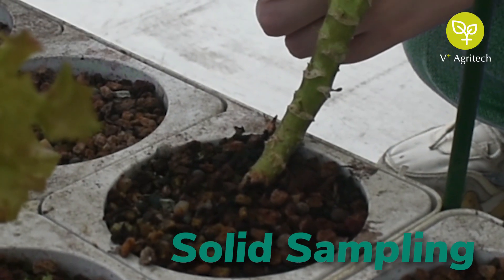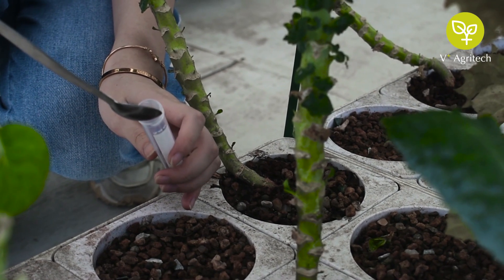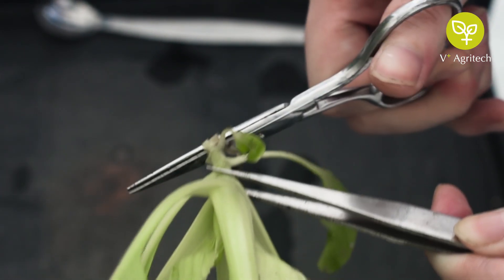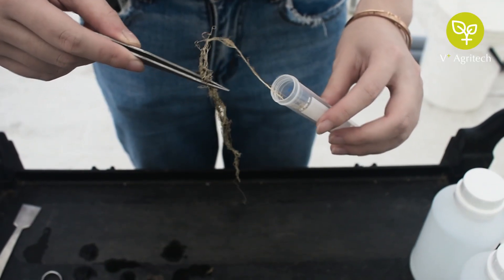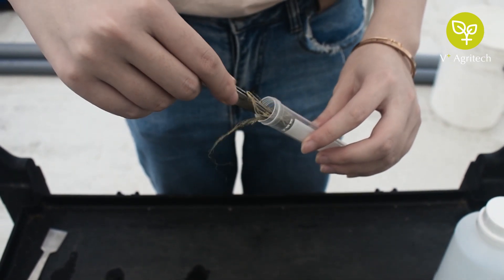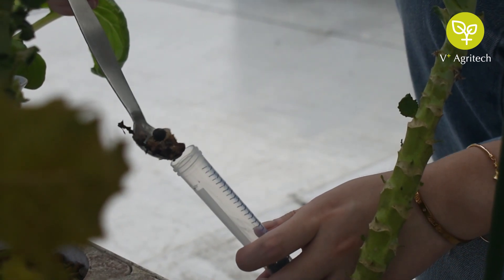Let's collect the solid samples. Using the tweezer or spoon, collect the sample to be analysed. Avoid direct skin contact to prevent contamination of the sample. Place the sample into the 15ml tube. Aim to loosely fill to at least one third of the tube. Do not crush or squeeze the samples in.